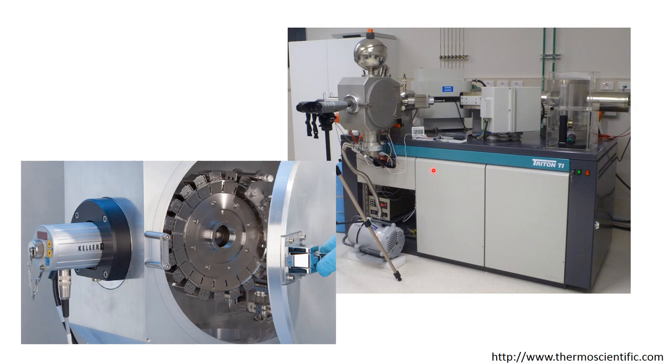Just to point out, this thing down here is the pump. Every time we open up this end of the mass spectrometer, we add lots of air into the system, and that is bad because mass spectrometers tend to work at a high vacuum. So every time we open up the system, we need to pump out all of the air before we can measure anything. And this system over here is a thermal imaging camera. It looks through to the filament as it heats up to allow us to measure the temperature of our filament as we're heating it up, so we can monitor the ionization.